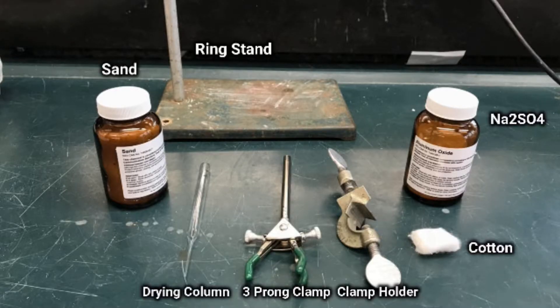In part 2, we will demonstrate how to set up a drying column. You will need sand, a pipette, sodium sulfate, cotton, and a ring stand.